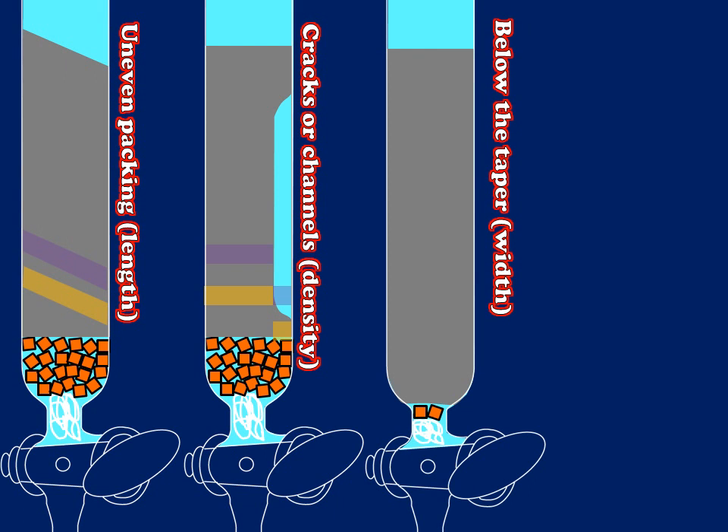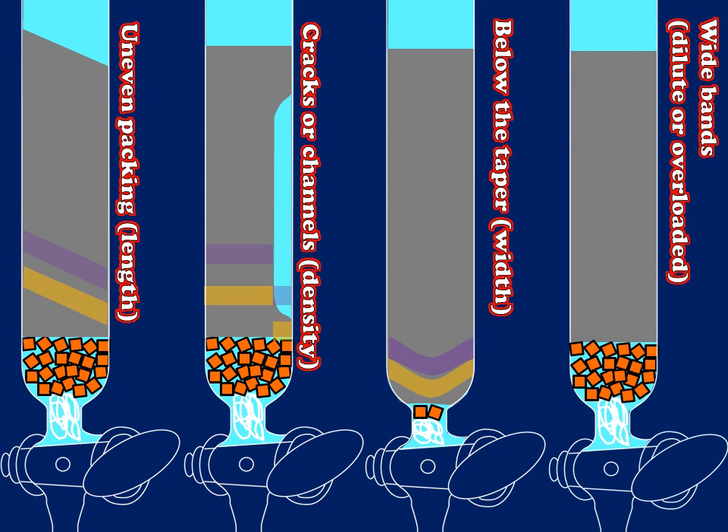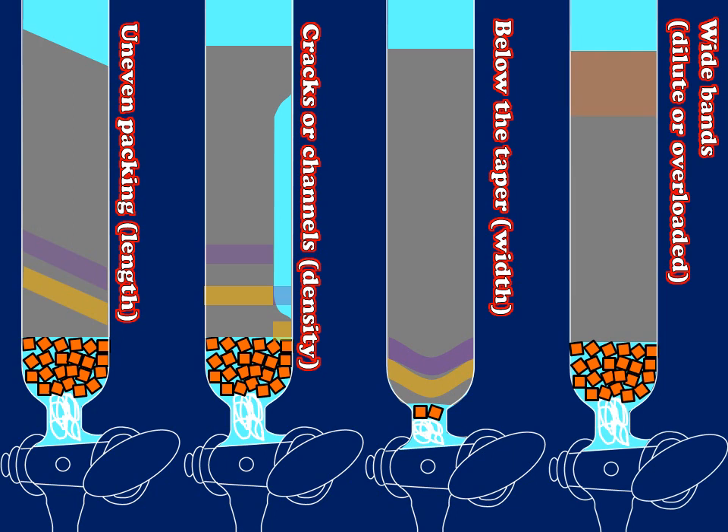In my third example, I haven't added enough sand and my column is within the tapered region of the actual chromatography column. When I properly load and run a sample, everything is going great at first, but when I reach that narrow region at the base, my bands distort because the distance they must travel to reach the exit has changed. Finally, if I have a well-packed column but load a very wide band of analyte, the wide bands have left me with a region which is overlapping. In all of these columns near the end of my run, I have both compounds eluting simultaneously.